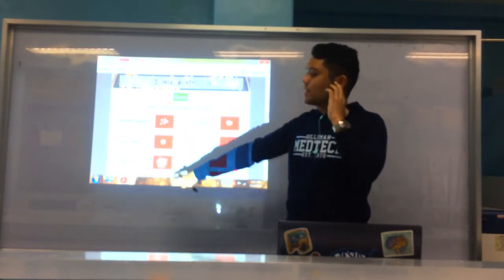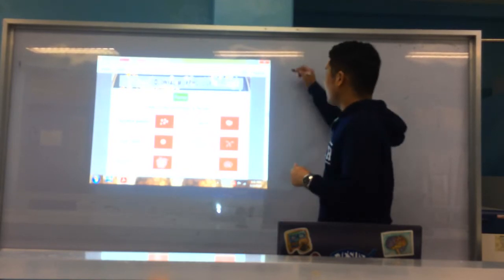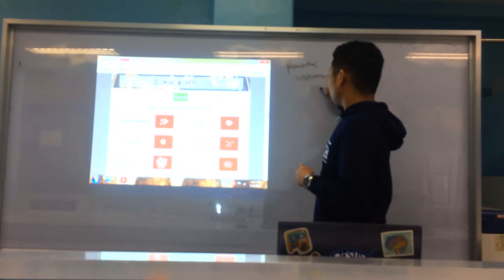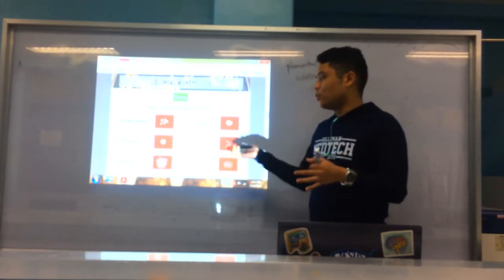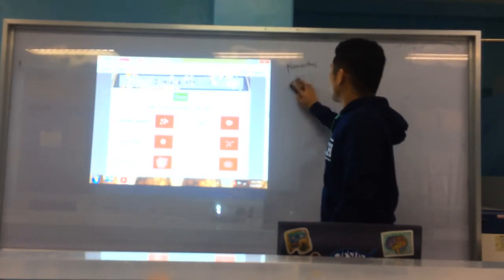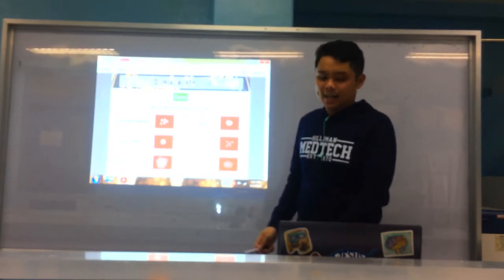Alright, so filamentous, basically, you observe this type of colonies or rhizoid probably in fungi, usually, or filamentous bacteria. Filamentous bacteria, for example, Actinomyces or Nocardia. Okay? So filamentous, fungi-like bacteria. They're not fungi, but they're bacteria. But their appearance, under gram staining or sometimes in culture, looks like fungi. That's why they're called fungi-like bacteria. Okay. Alright. So in terms of form, you describe its appearance. So circular colonies, punctiform colonies, and so on. Rhizoid, and so on. Okay. Alright.